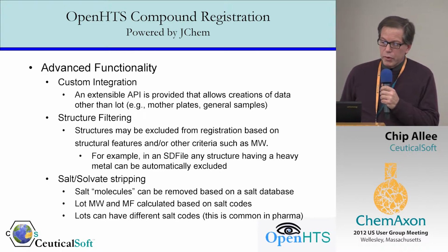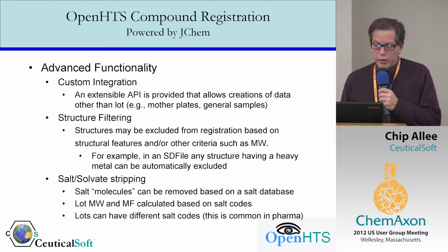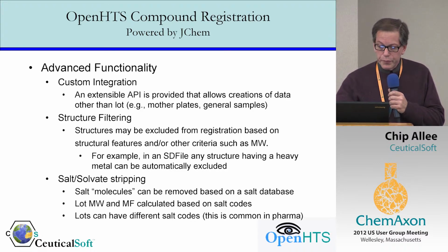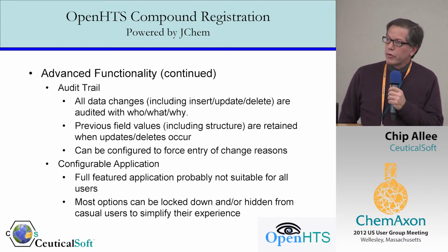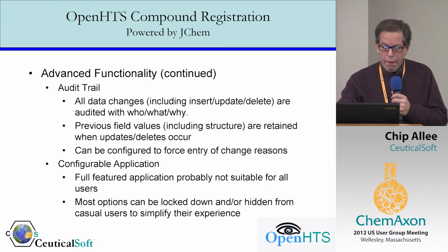Structure filtering capabilities, excluding compounds based on various criteria, et cetera. We have full salt stripping capabilities and salt handling built into it. And there's a complete audit trail capability for any sort of structure changes if you're updating compounds, et cetera.